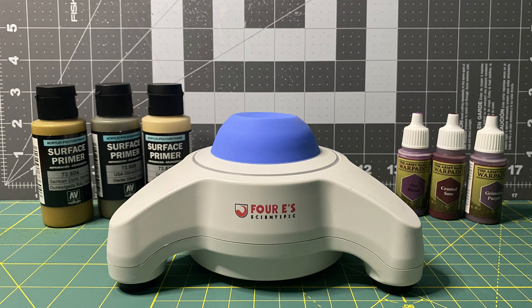Now, it may sound like the 4E Scientific Lab Vortex Shaker is the only option between these two, but with a hefty price of just over 100 US dollars versus the fingernail polish shaker's 25 US dollars, the choice will likely be dependent on your budget.